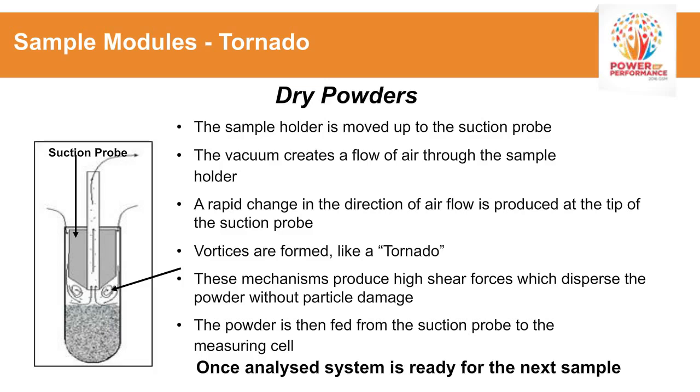So for cement, it's not quite as fragile, but in some applications you could have fragile particles that might break if you have too much velocity. And this can happen in pressurized systems where you are forcing the particles under very high pressure. You can tend to break them.